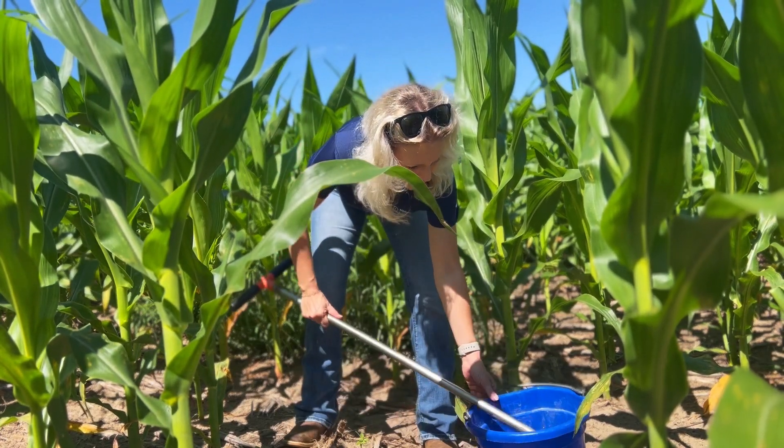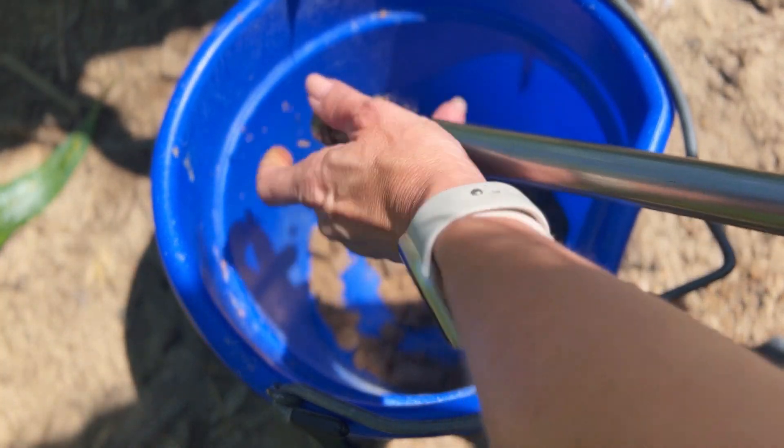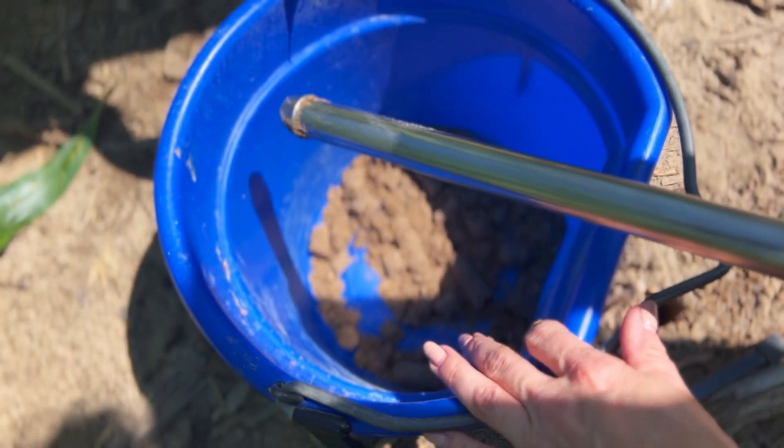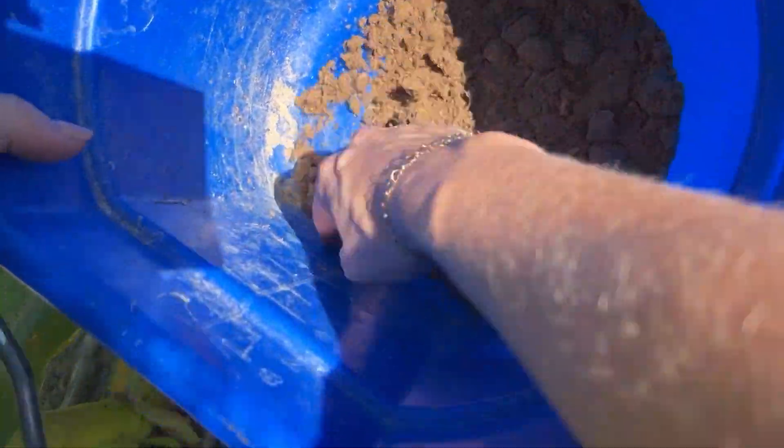If there's a little bit of moisture mixed in there, that's totally fine because we will be drying that down. After you've taken a few different samples, you'll mix that together in the bucket.